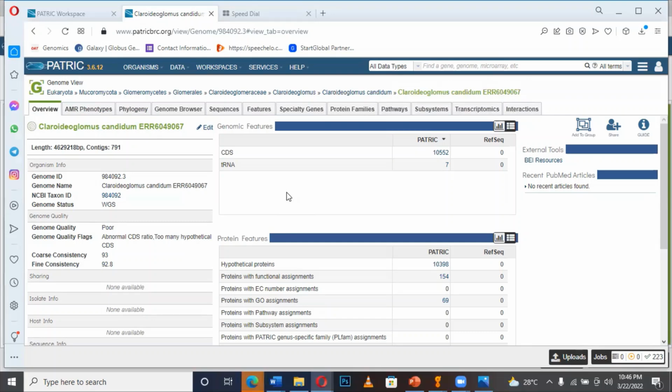So we look at how we can compare the result of one genome from another. And in that particular course, we also explore a project where we'll be able to have a practical knowledge of how we can interpret our evaluated results into a publication article.